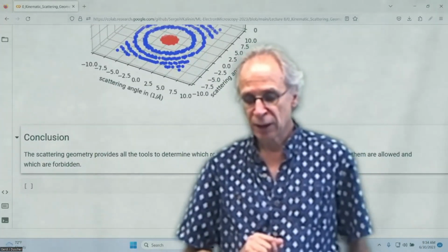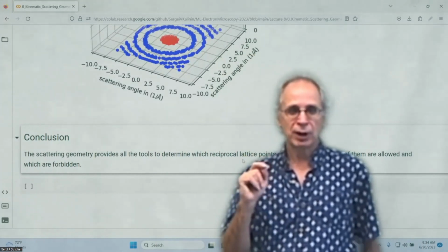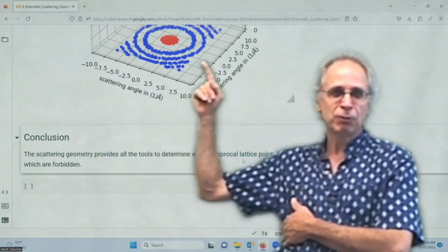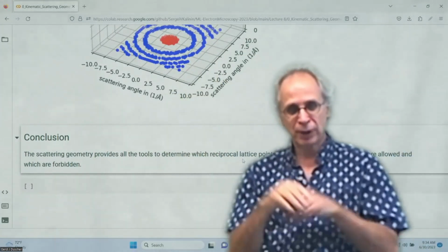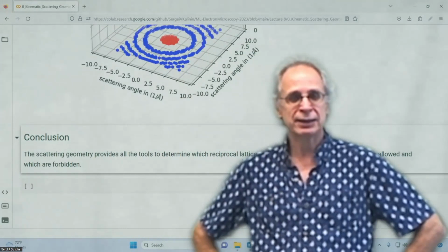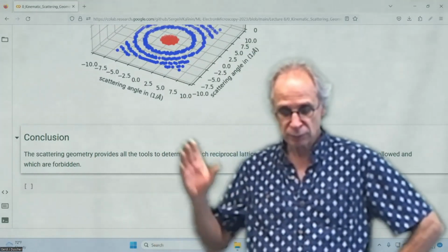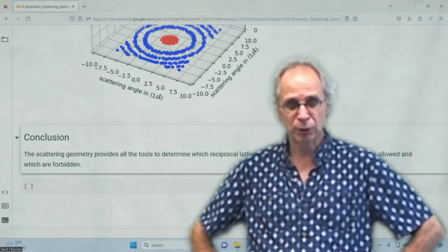Okay, so we have defined excitation error, and we now know what I'm doing in order to get in the images my diffraction pattern. Or if you have a diffraction pattern and you want to simulate that, that's what you do. And the machinery is based on trigonometry only.